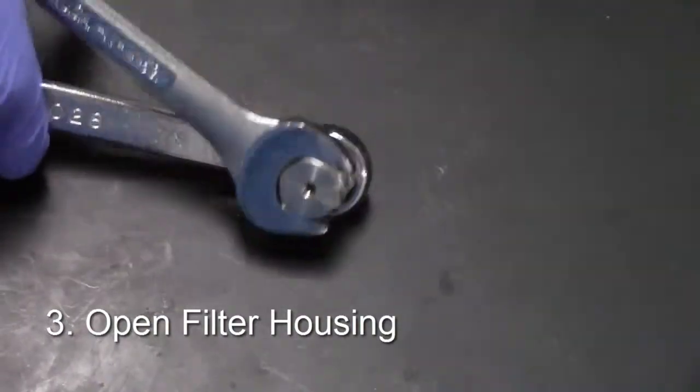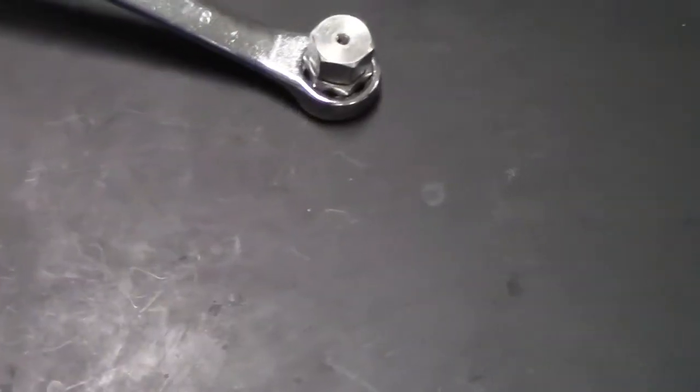Step 3. Open the filter housing. Using the wrenches, unscrew the two exterior housing components.